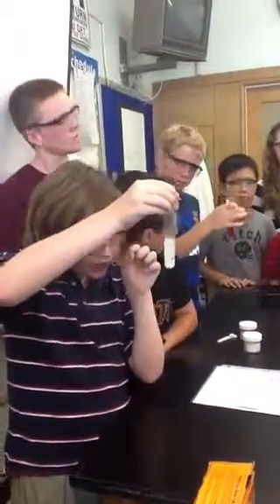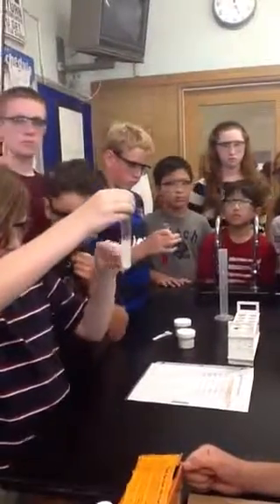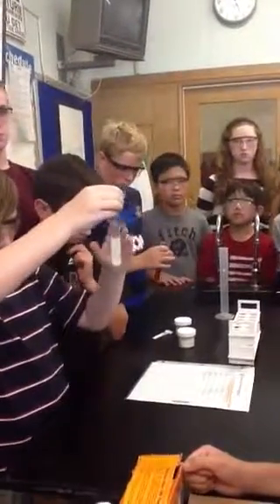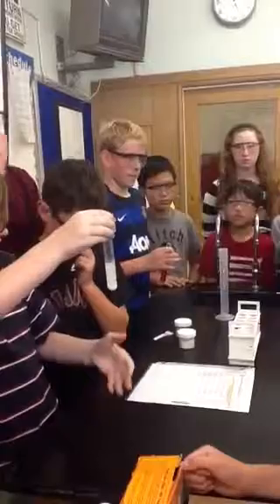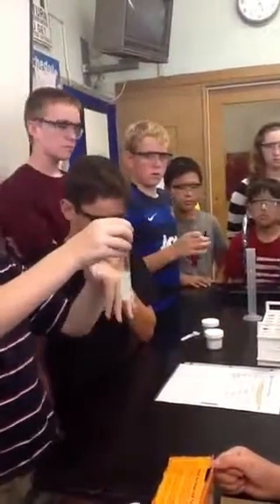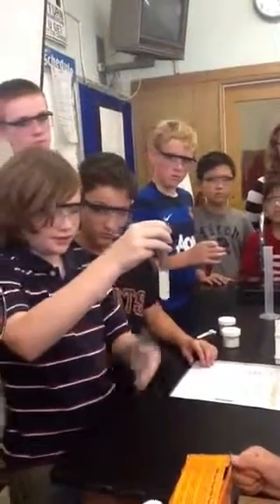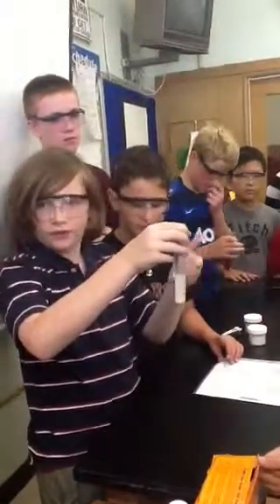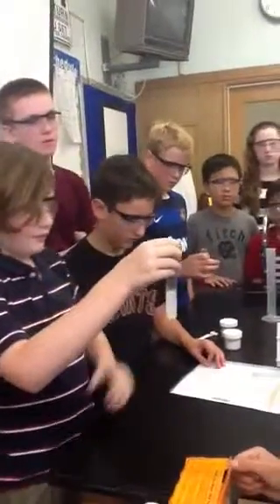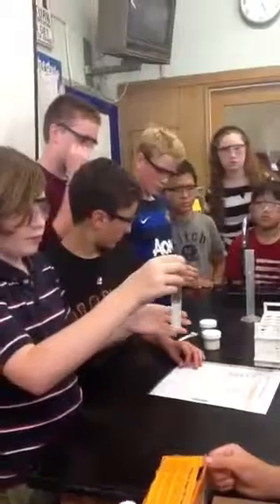And if you look close enough, you can see little particles of substance F floating inside the water. So they didn't fully mix. The substance F just kind of went into the water and sunk. Well, not only sunk, part of it floated, but it didn't mix. It's not a new substance. It's just substance F and water.